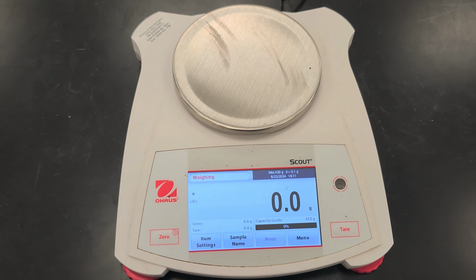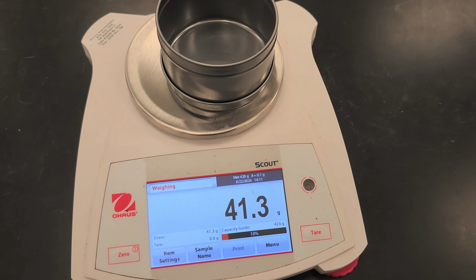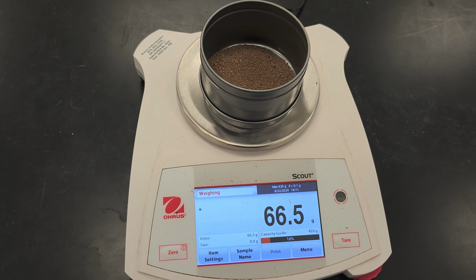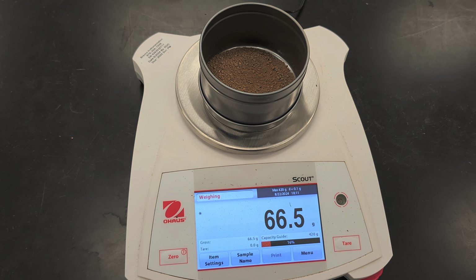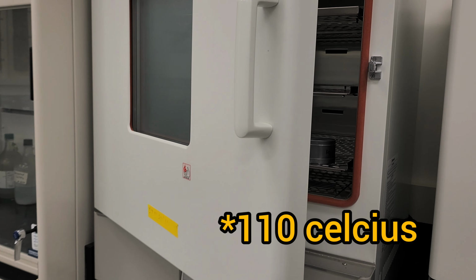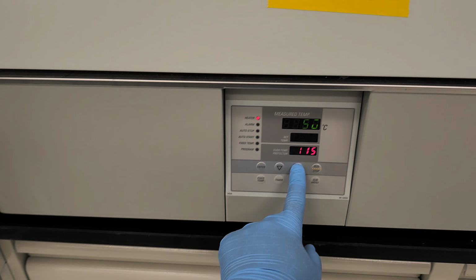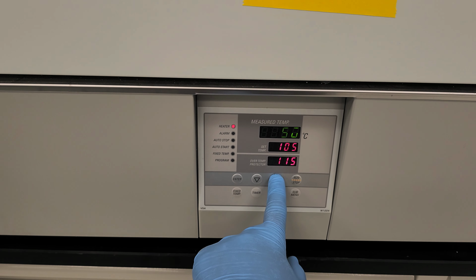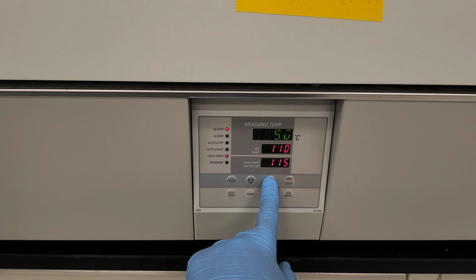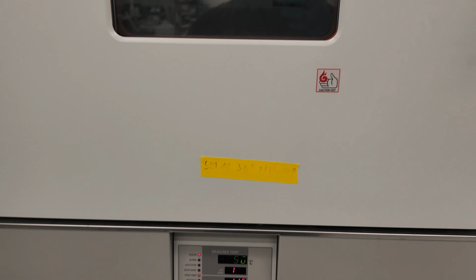For the moisture determination, take the weight of the can and lid and soil separately. Put it in an oven at 100 degrees Celsius for 1 day. After 24 hours, take the sample out and take the weight of the soil sample and calculate the moisture percentage.